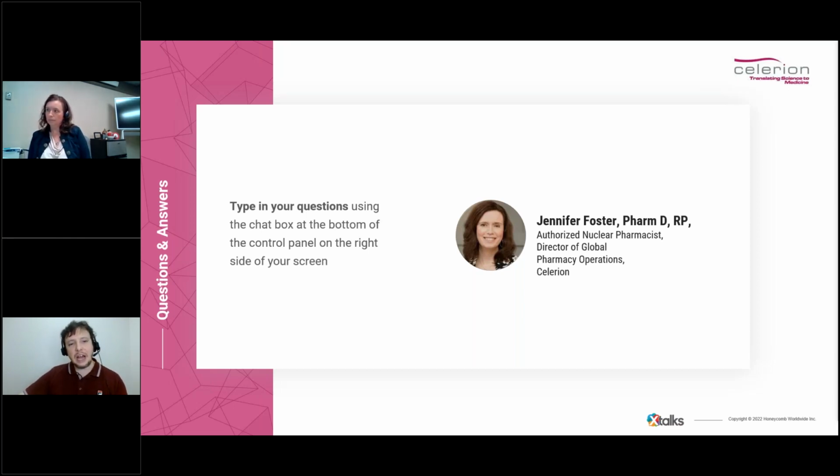Next, we have someone asking, how often is your compounding suite certified? And what do you do if something fails? Oh, right. So it is certified by an outside vendor every 6 months. If we do have an area that fails, we will investigate if we can figure out any reason why it may have failed. And really, the first thing we do is clean the area and then retest. So say it's a surface sample that's failed, for instance, we will clean the area with both a sporicidal and an antimicrobial, and then we'll retest it and make sure it's passed at that point.